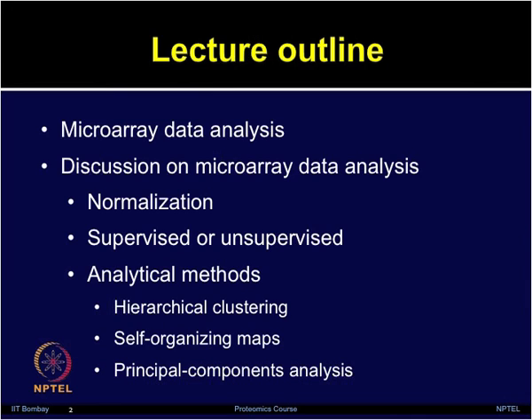We will have a discussion on microarray data analysis covering various concepts such as normalization, supervised or unsupervised analysis, and different analytical methods such as hierarchical clustering, self-organizing maps, and principal component analysis.